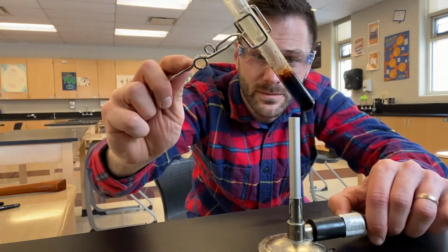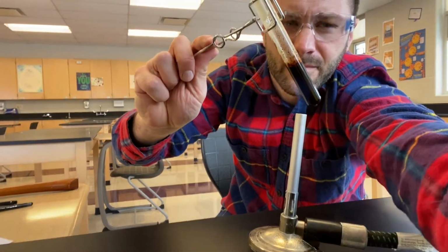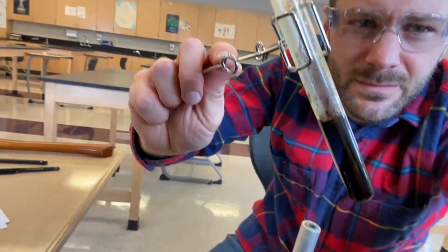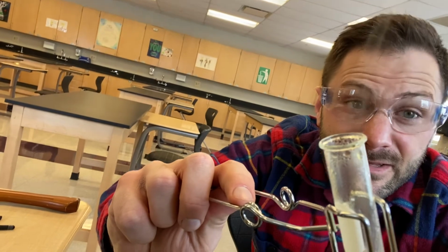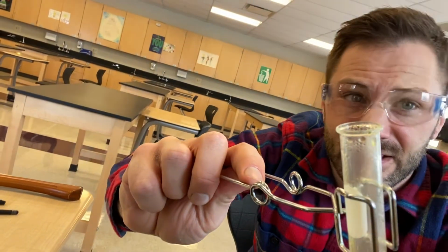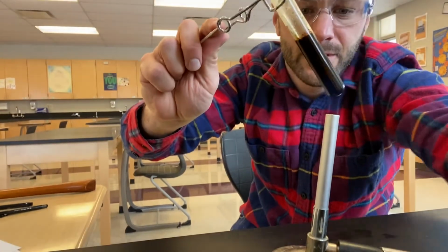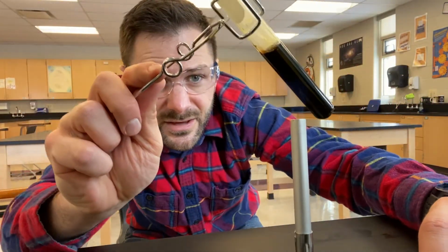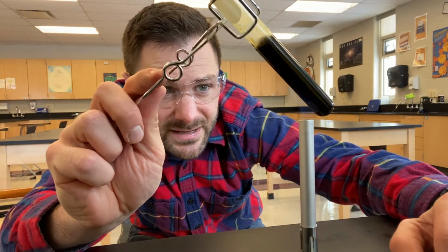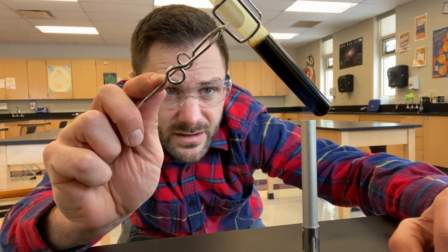I'm going to keep going. I really want to make sure I burn it. Let's look at the test tube up here. You can see heat rising out of the test tube, and what you're actually seeing is some sort of fog or smoke exiting the top. Let's keep going. Wow, it's really expanded in volume. It's taking up a lot more space in the test tube now, isn't it?